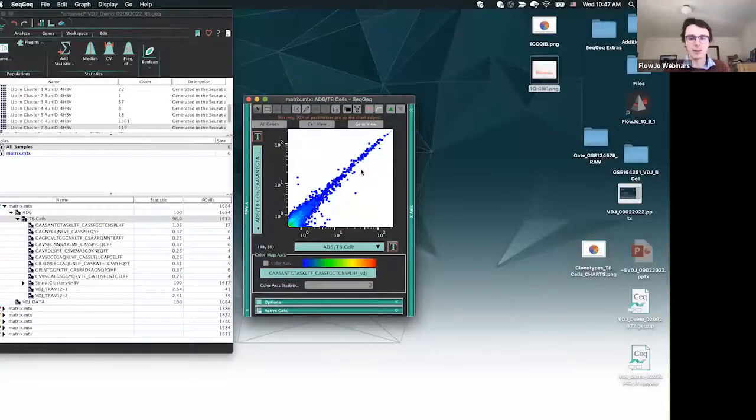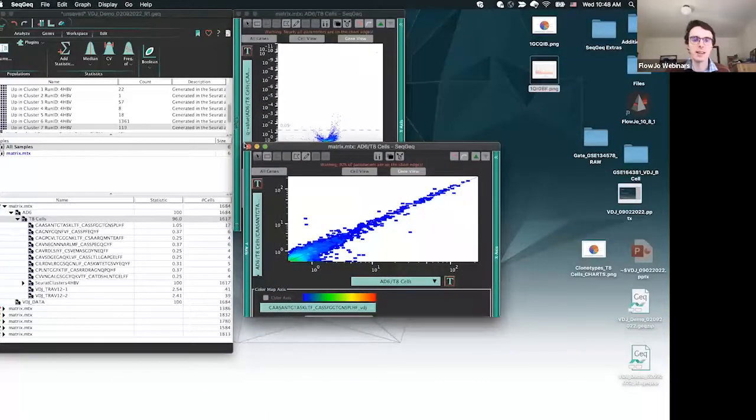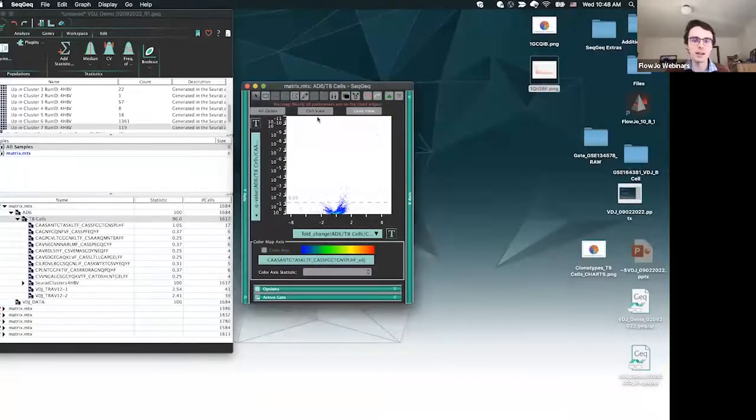And you can see already some of the genes that are present in my clonotype that maybe aren't present as much in the rest of my cells. But if I press the volcano plot up and down arrow, I can do differential expression analysis and get this plot over here.